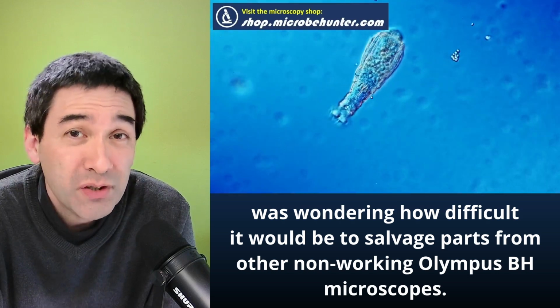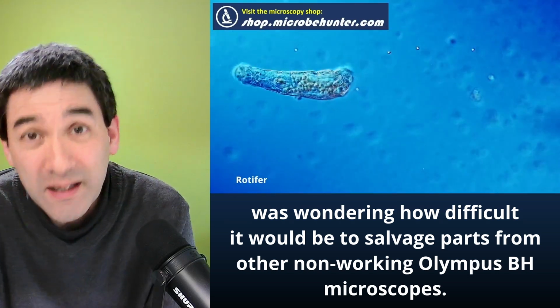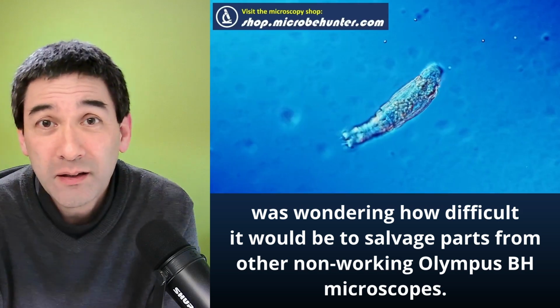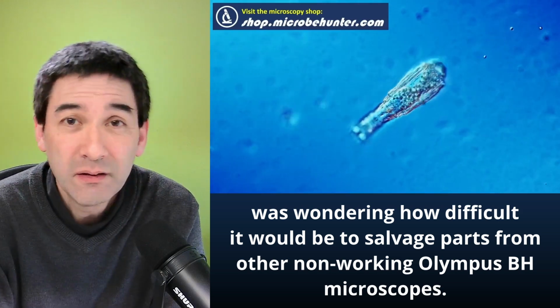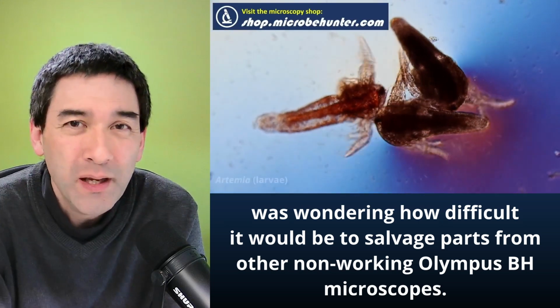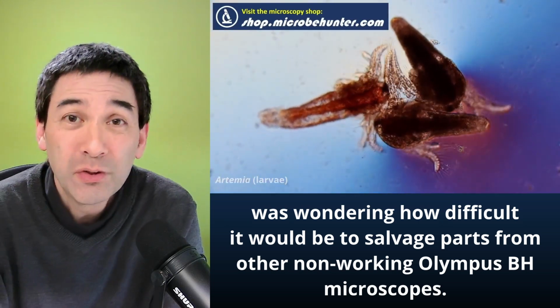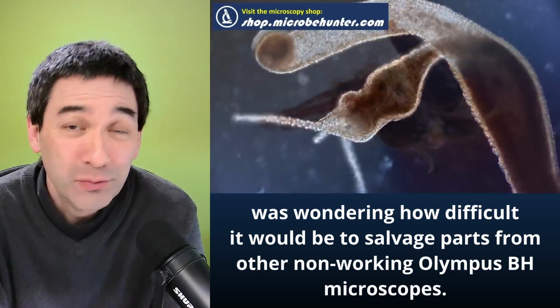Because you might not find the parts that you need, you have to buy yourself a second microscope, and then you basically disassemble it and reuse the parts. So you see, it's not automatically cheaper this way. How can it be justified? Well, it can be justified because you're learning a lot, and because it's interesting and fun to do.